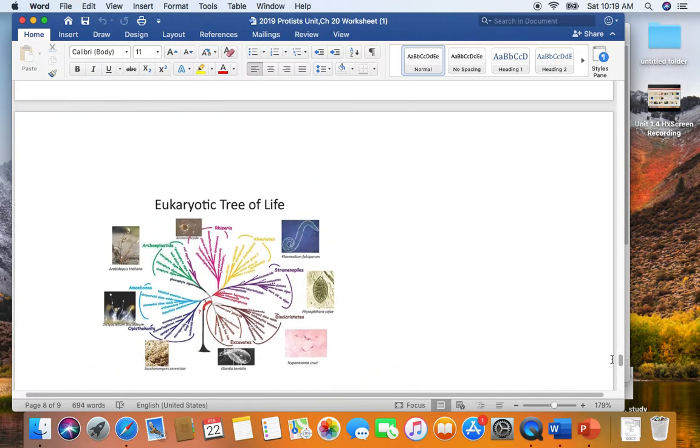Okay, folks, just really briefly as a bonus question, there is one sexually transmitted, no, sorry, not intestinal, apologies, there's one sexually transmitted protozoal parasite. This would be a bonus on our lab exam. It's called Trichomonas vaginalis, the most commonly diagnosed protozoal urogenital tract infection in humans, certainly here in the United States. We'll have some prepared demo slides of Trichomonas vaginalis.